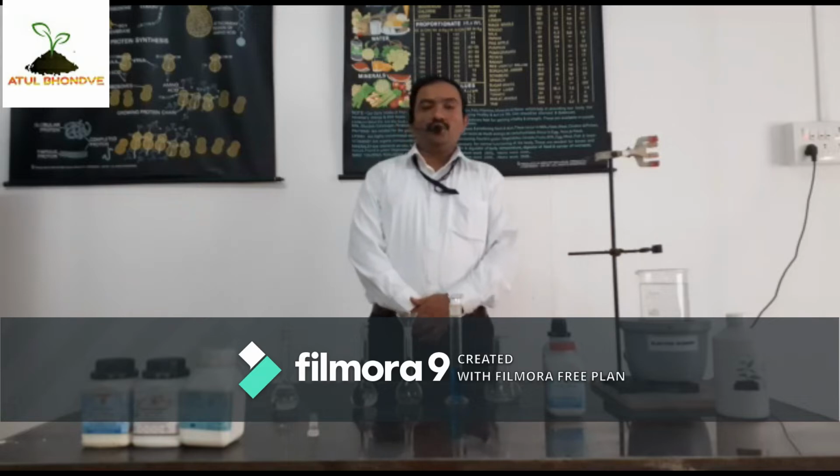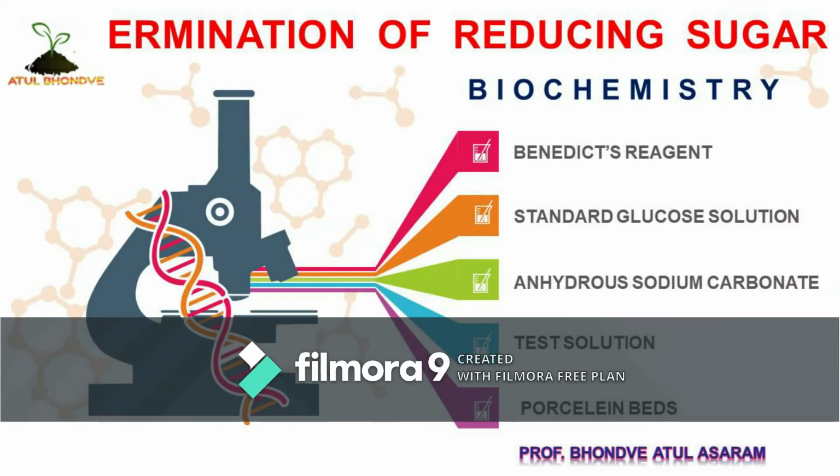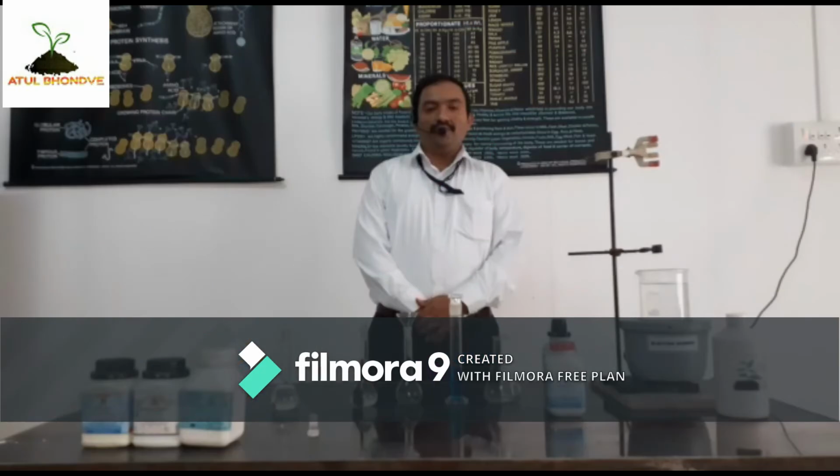Biochemistry. Students, before this practical we performed three practicals. In the first practical we performed the qualitative test for carbohydrates. In the second practical we performed the qualitative test for amino acids, and in the third practical we performed the qualitative test of lipids. In today's practical we will perform the determination of reducing sugar.